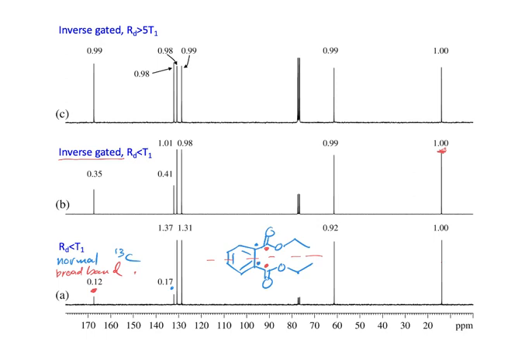I guess they don't say, for the same amount of sample, how many scans they had to do or anything like that. I'm not sure exactly. They didn't really tell me in this book where I got it. I think this is from our text. Exactly the difference in number of scans that they did or anything like that. But it can make a big difference.